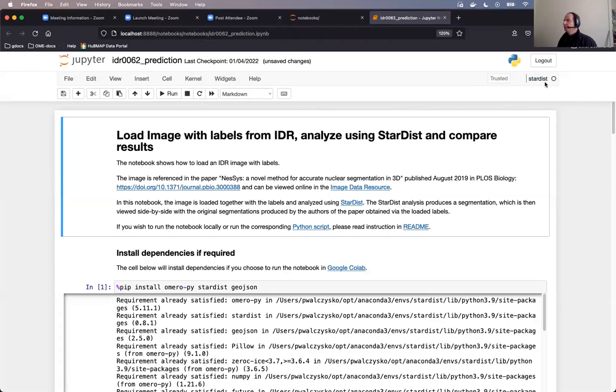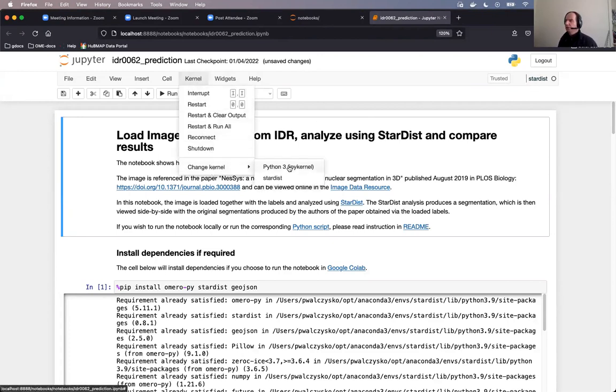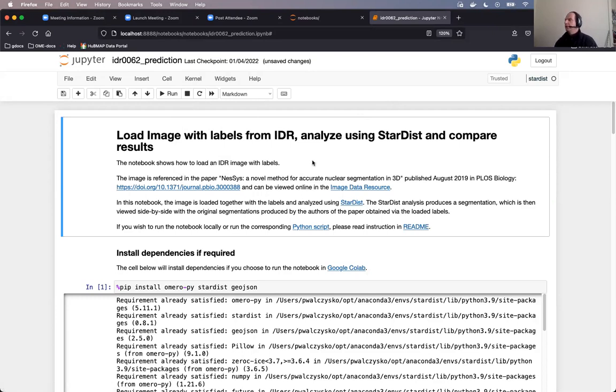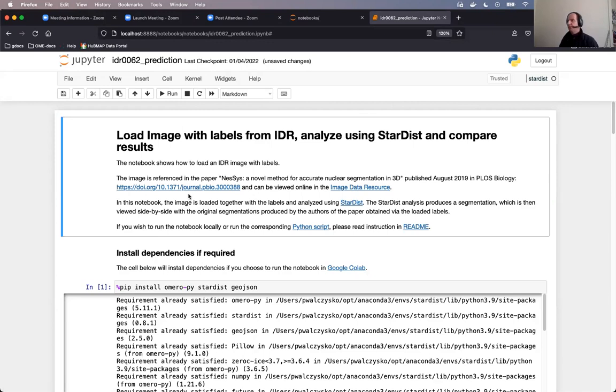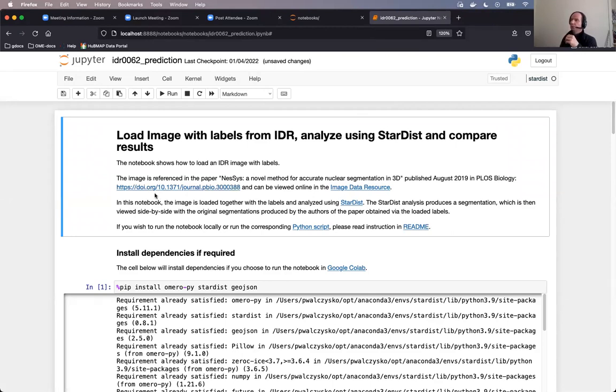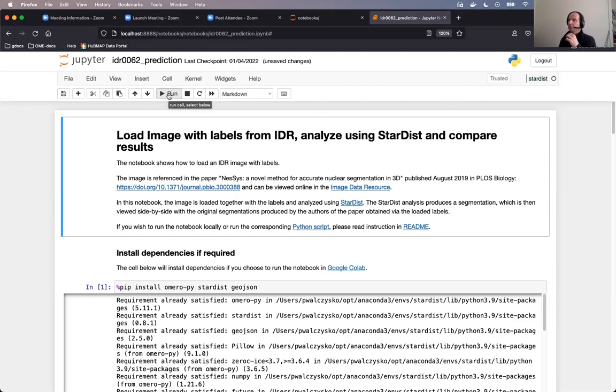So first of all, you have to verify that on the top right, you have a kernel called Stardist. If not, then you have to go to kernel, change kernel, and Stardist. Kernel is the runtime environment, which basically executes the commands you give inside the Jupyter notebook. And you just built, let's say, on the conda environment, this Stardist environment, you will have to add it as a kernel into Jupyter notebook, or it will be added there automatically for you. You will, in any case, have to quickly check that this is Stardist. It really depends on which way of building this environment you chose.